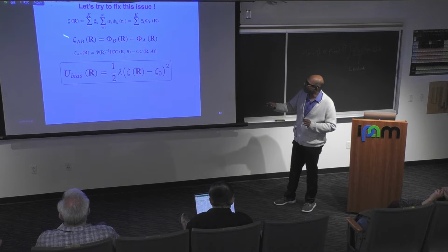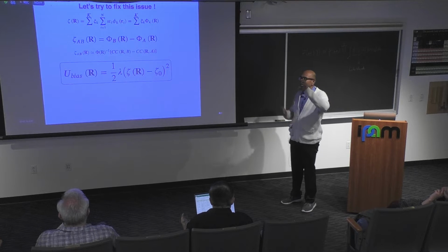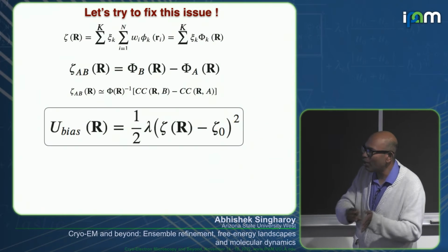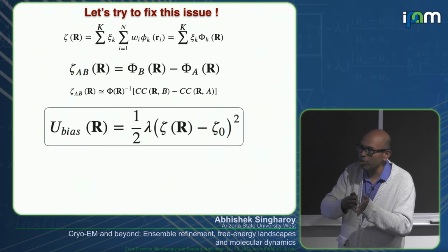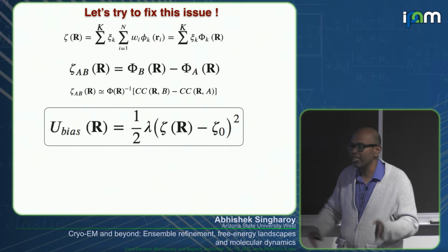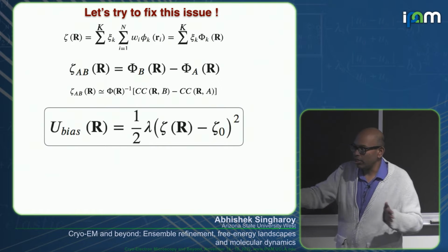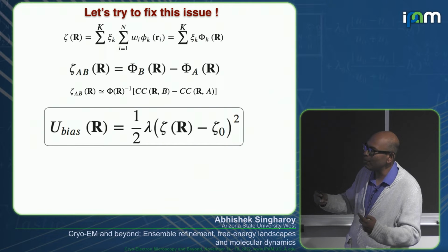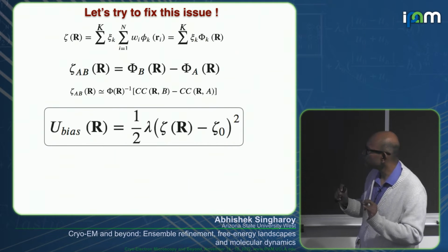And let's make a collective variable that's nothing but essentially the density itself, the difference of the sum of the densities. So you take a map, you take the local densities of the map, and you literally sum them up. It's a very simple treatment. There's no rocket science here. And then essentially you create a path along your densities where, let's say you start from 0 and the last density is 10. You can say 0, 1, 2, 3, 4, 5. Now, is the density path right or wrong? I'm not asking. I'm simply translating my density map into a linear variable.